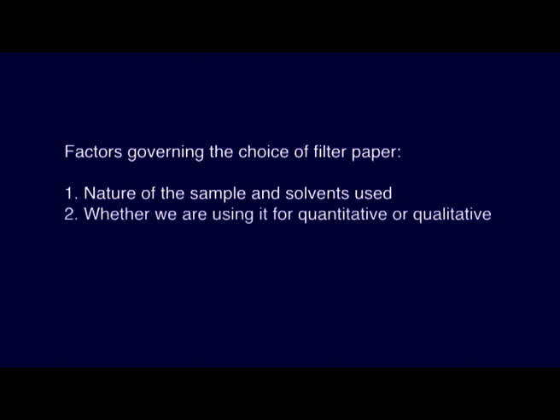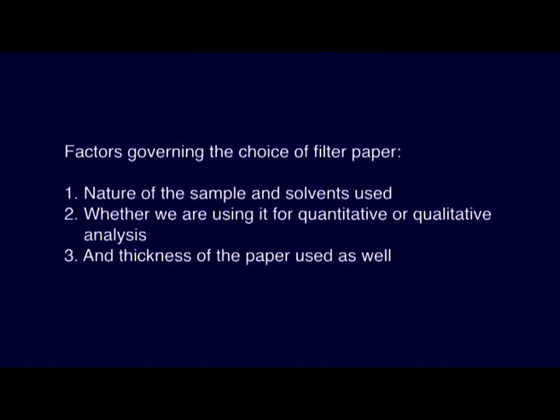Another is the hydrophobic paper, made by acetylation of the OH group in the cellulose to make it hydrophobic in nature. Factors governing the choice of the filter paper used as a stationary phase are the nature of the samples and the solvents employed for the separation, whether the separation is for a quantitative or a qualitative purpose, and the thickness of the paper used.